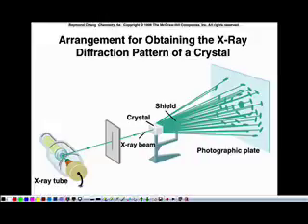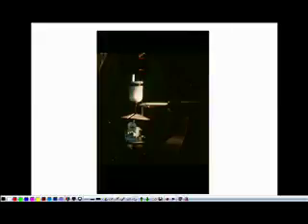We have what's called a powder diffraction instrument, but places like Case and Youngstown State have a couple of these instruments, and so sometimes I'll send crystals down there to have their structures done. I did this for 2 years as a postdoc nearly 20 years ago when I was at Brown. Basically, you take the crystal, which is no more than a millimeter wide for a normal organic molecule, and you put it on the end of a glass fiber.